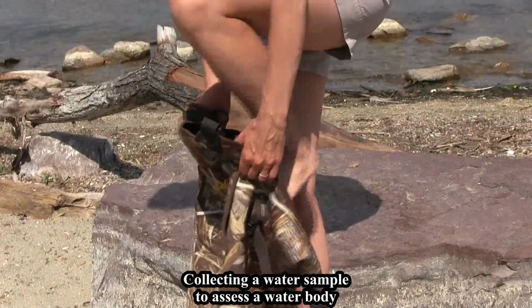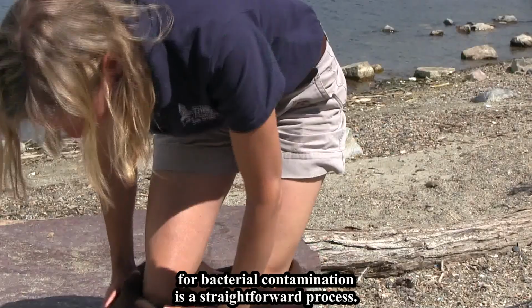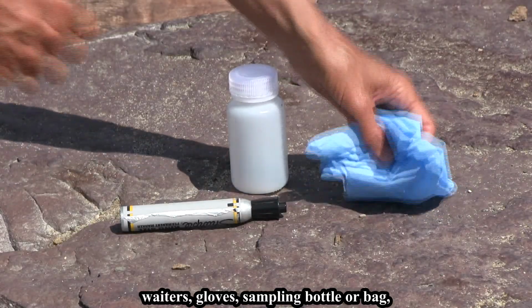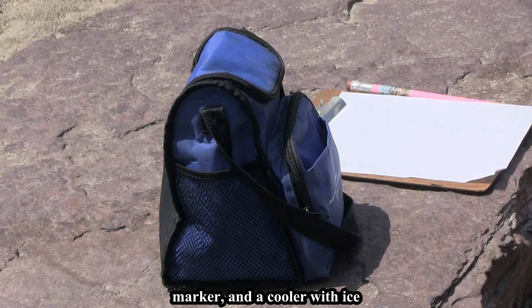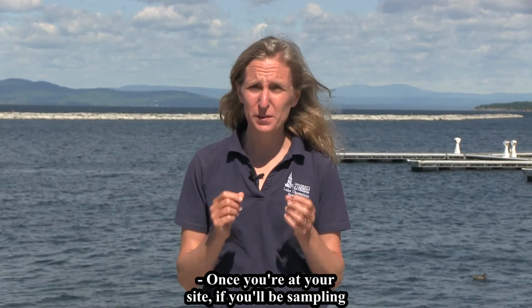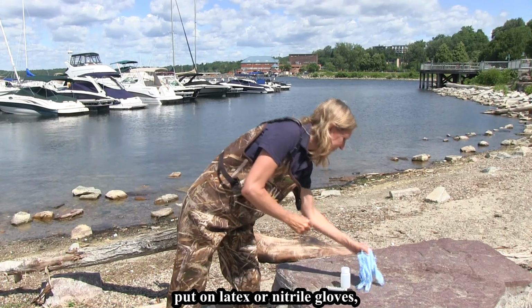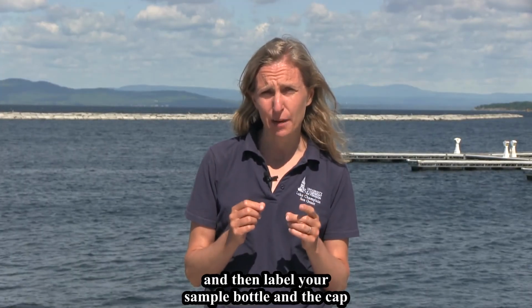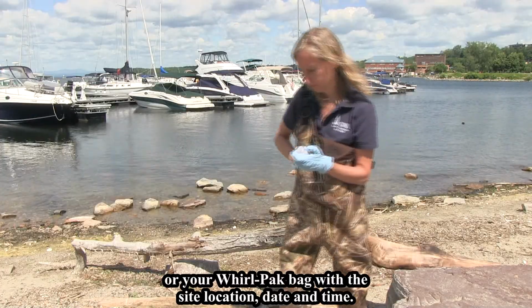Collecting a water sample to assess a water body for bacterial contamination is a straightforward process. Gather the required supplies, including waders, gloves, sampling bottle or bag, marker, and a cooler with ice before heading to the monitoring location. Once you're at your site, if you'll be sampling from the water, put on waders, disinfect your hands, put on latex or nitrile gloves, and then label your sample bottle and the cap or your Whirlpack bag with the site location, date, and time.